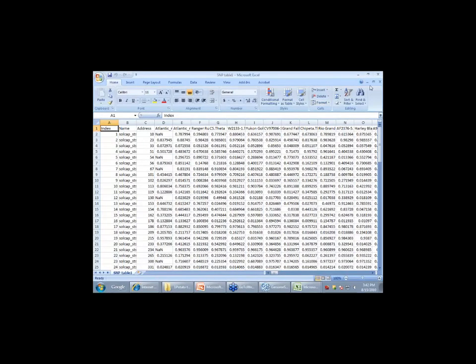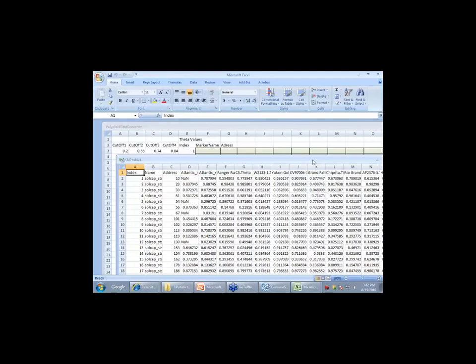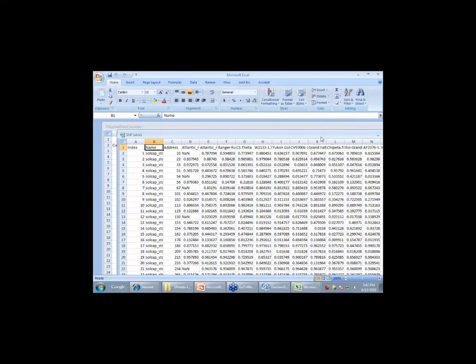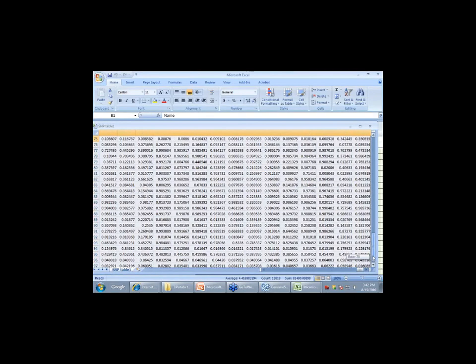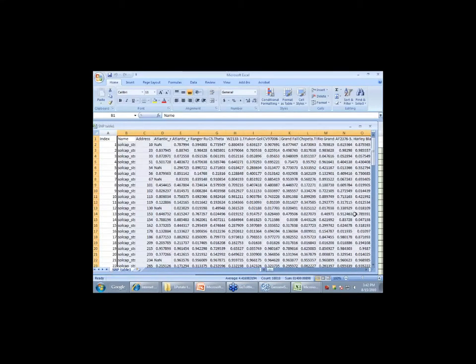What we're going to do is capture the marker name and all the data. So everything from column B, actually you can even highlight column B, B1 to the rest of the data. Capture all that data. So I hit the shift key and I highlighted everything in between. Went to the bottom right corner, top left. Okay? We're going to copy that.